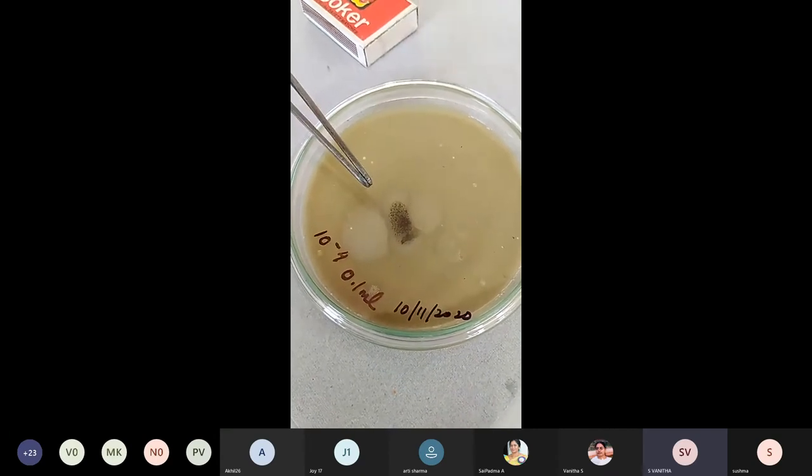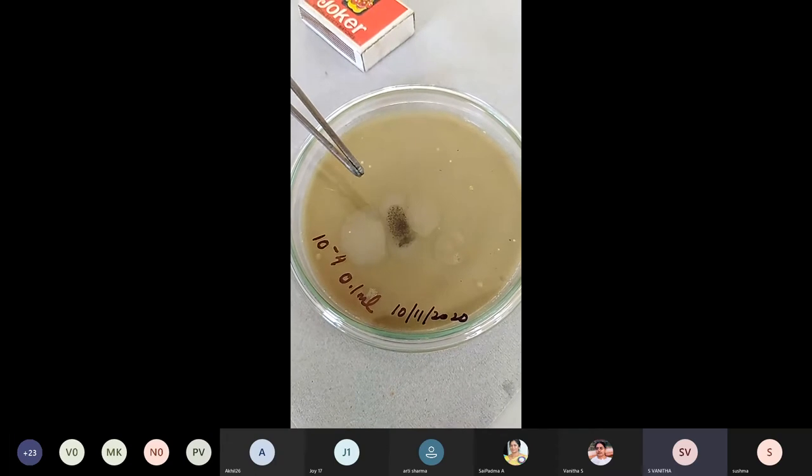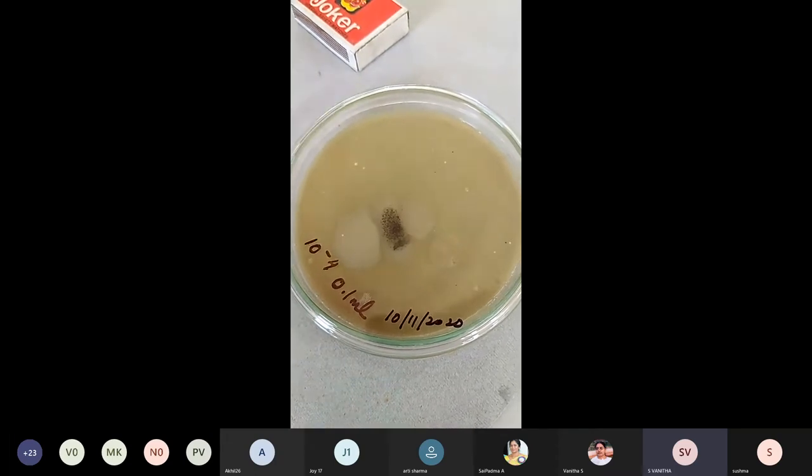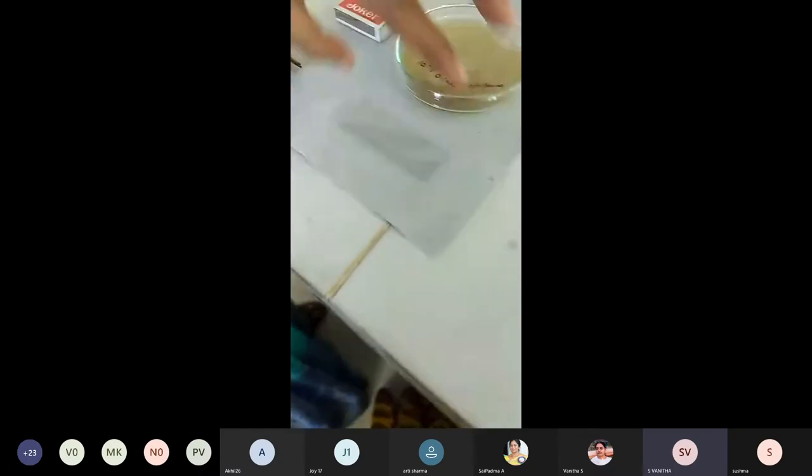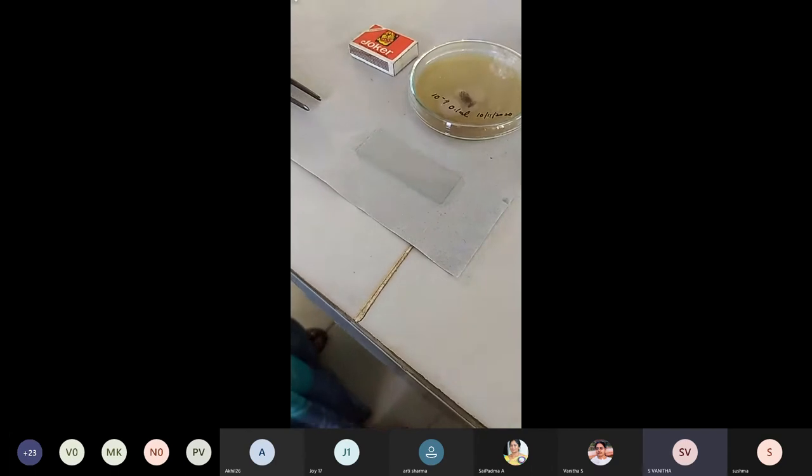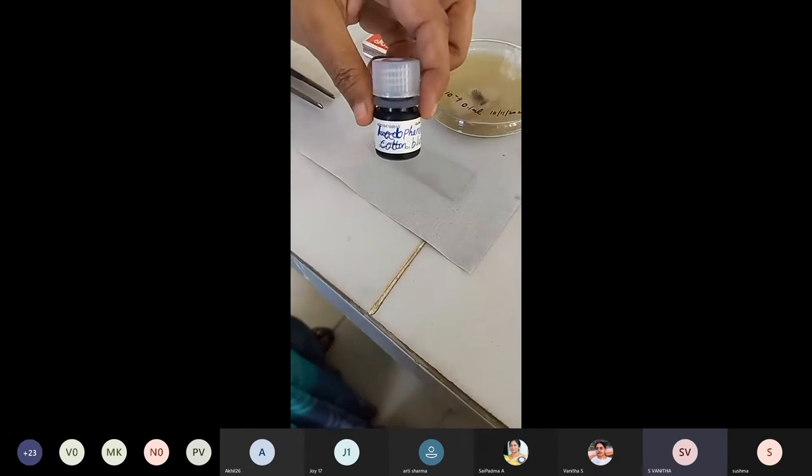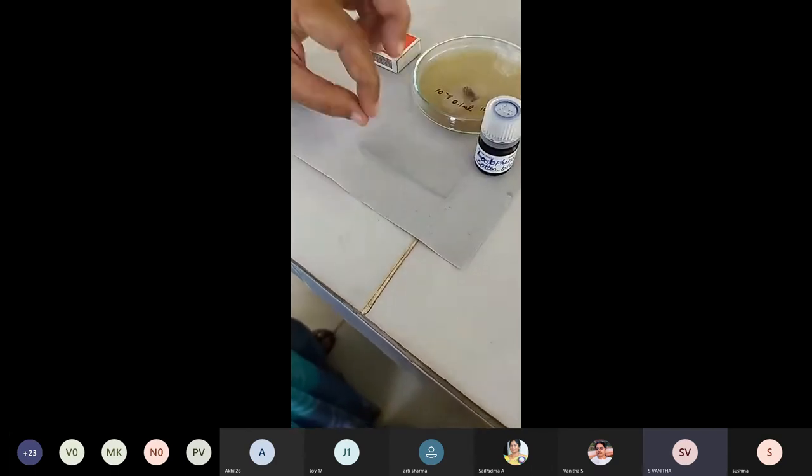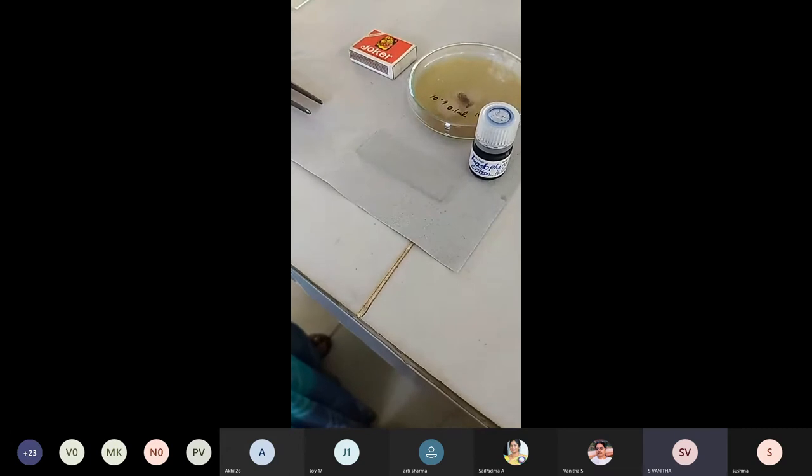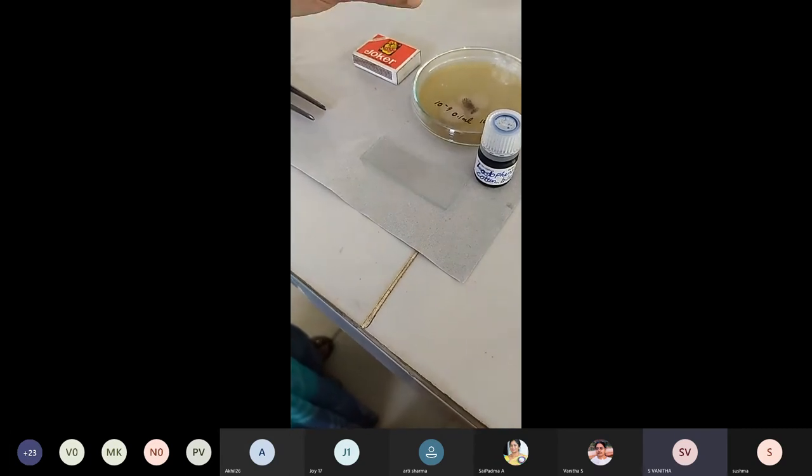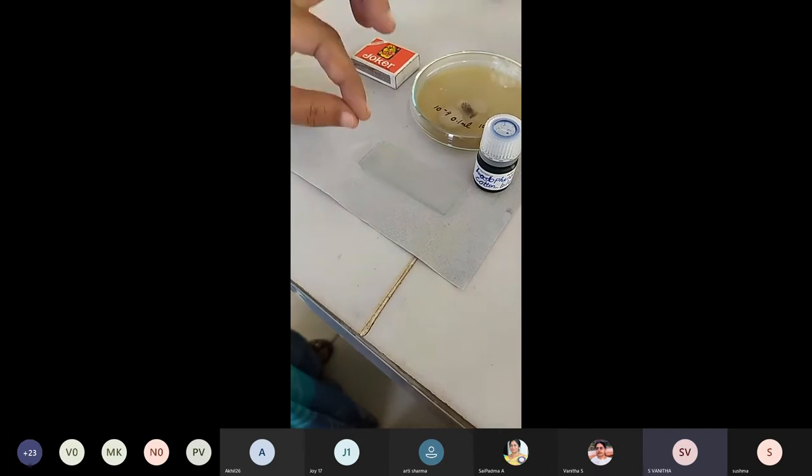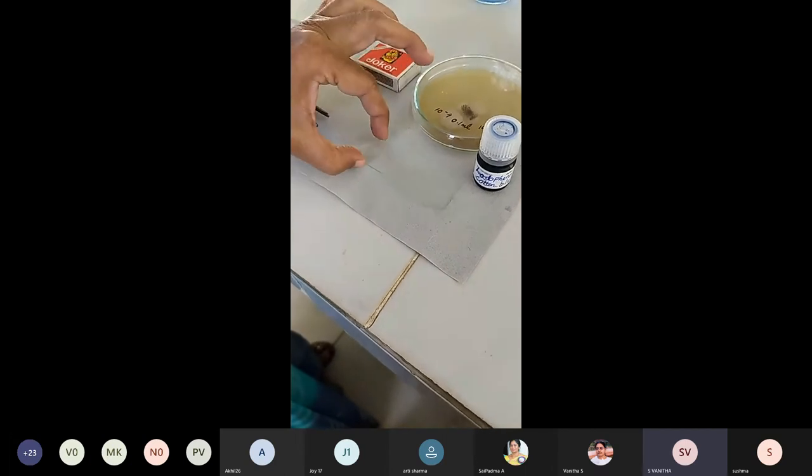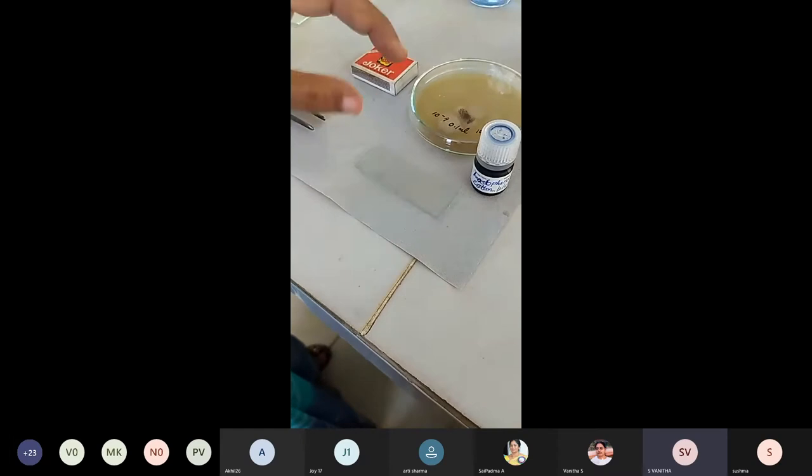So what is the stain we are going to use here is Lactophenol cotton blue stain. We have to take a clean glass slide. To this clean glass slide we are going to add a drop of the Lactophenol. This is the stain what we have got, Lactophenol stain. We are going to add a drop to the center of the slide. Then we have to sterilize the inoculation loop and take few cultures from the fungal culture plate and put or drop it on top of the slide where we have already placed the Lactophenol.